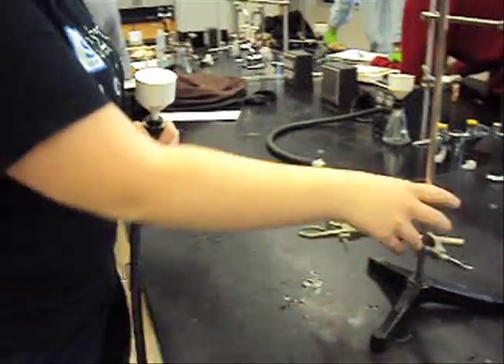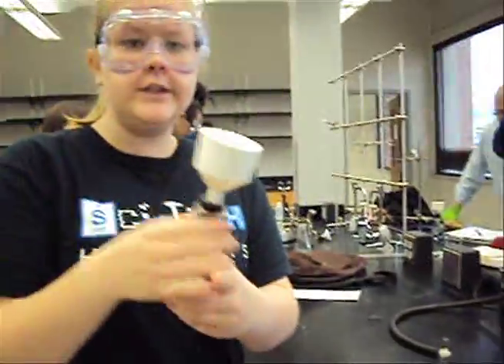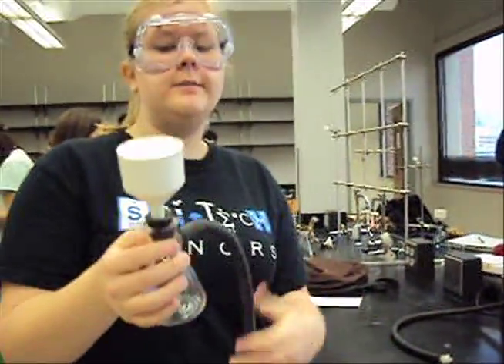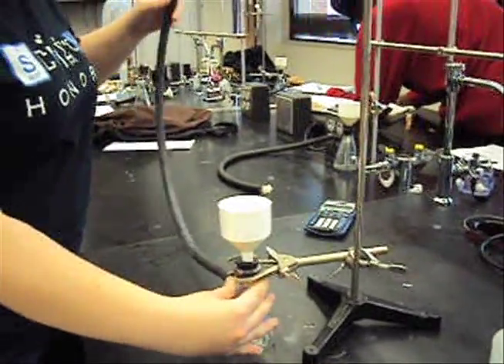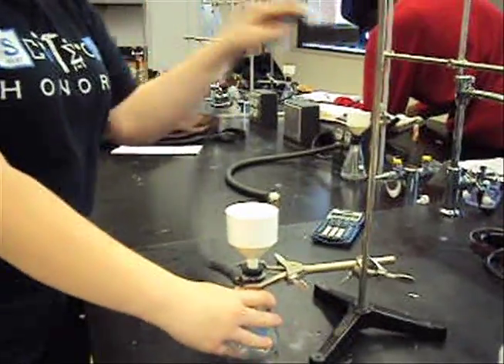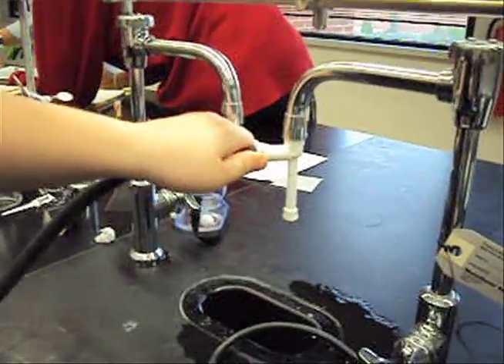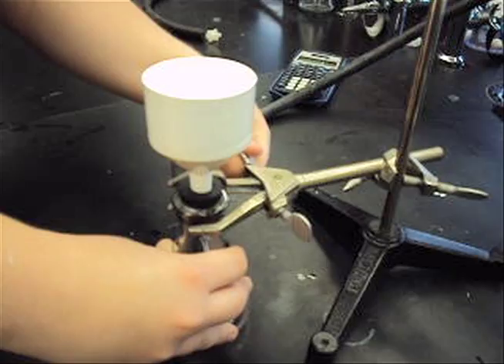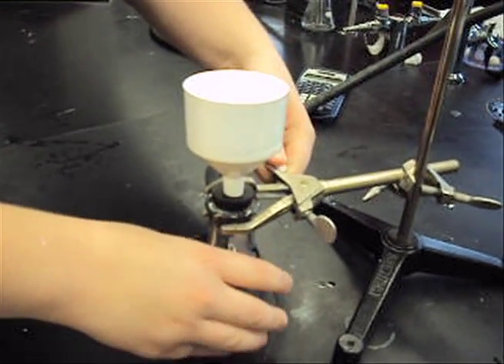We have this setup with a stand and a clamp. This is really top-heavy, so you always want to make sure you clamp it or have someone hold it so that it doesn't fall over. So you just want to put that in there, and we're going to connect this to the aspirator over here. Get that in there nice and tight, and then we're just going to clamp this down so that it doesn't fall over, and we're ready to filter.